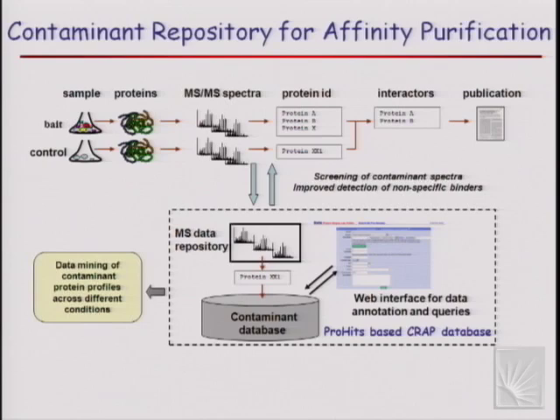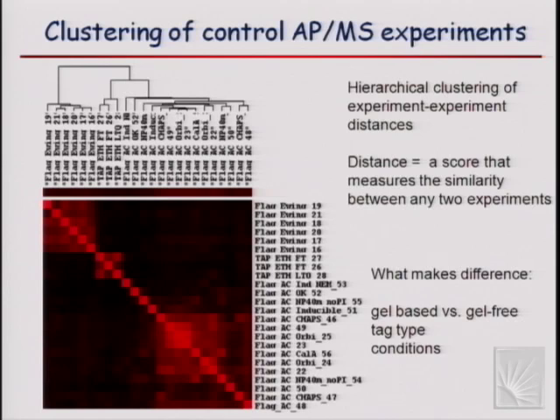By having this contaminant database, and that's all on the slide, right now we have quite a lot of data collected here, including data from Mike Washburn, from Rudy Ebersold's lab, Claude's data and other data sets. If you have enough data, we can already cluster these contaminant profiles across different experiments.